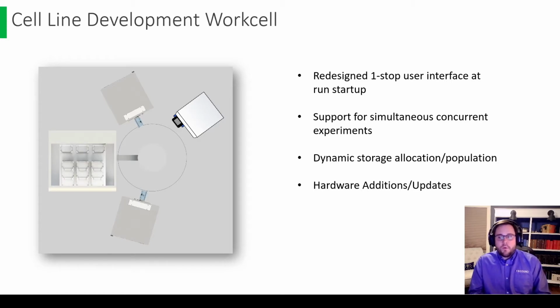The next thing was a OneStop user interface for the run startup, and I have that set up as the next slide in this presentation, but it allows us to collect all of the parameters that go into all the steps for this 2-week process into one screen that the user can touch once and then come back 2 weeks later when they get an email saying that their plates are finished, they've been picked into destinations, and the run is now complete. So you may have heard me just say that this was a 2-week process.